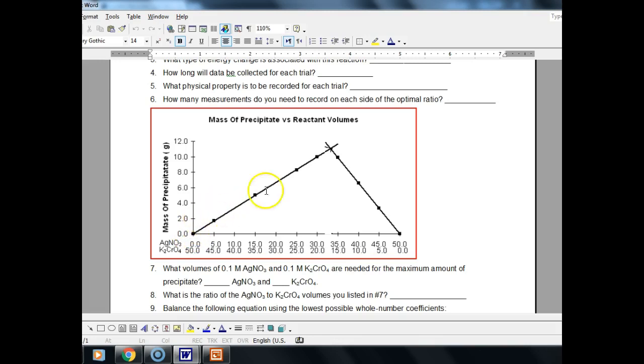If you notice here with this one, because the 2 points that were the highest were close together, the first line was put through the points that were all increasing, and then the second line was put through the points that were roughly at the same height that were decreasing. So you do not have to try to attempt, nor should you try to attempt, to get whatever your highest value is in both lines.